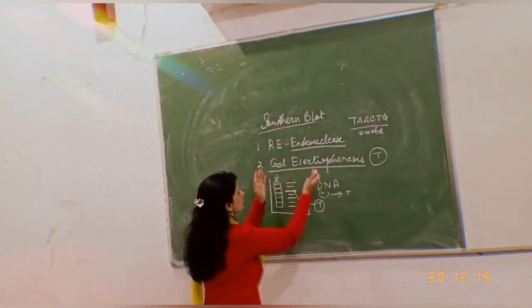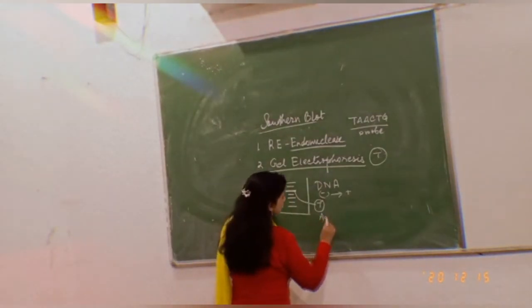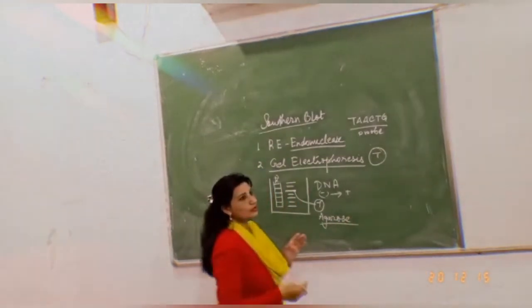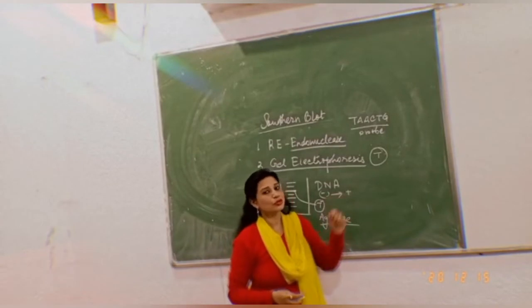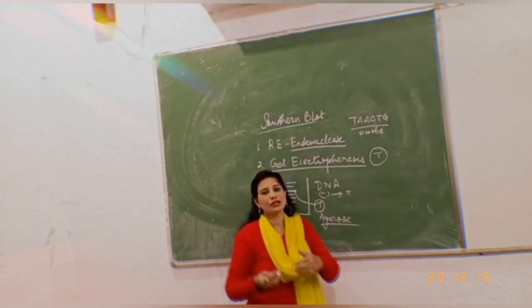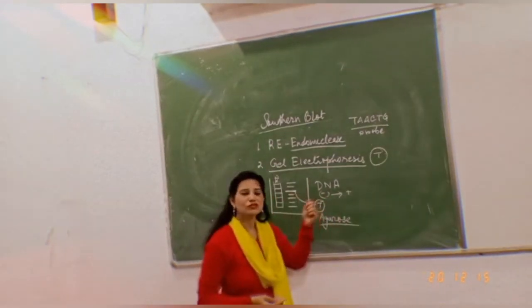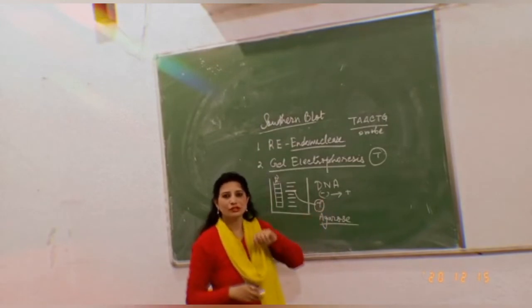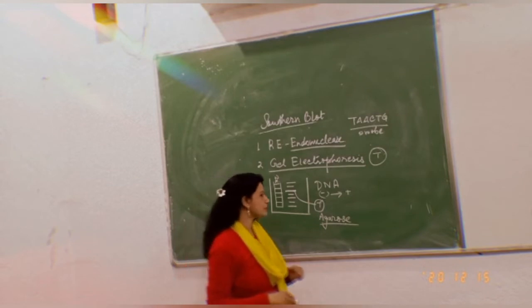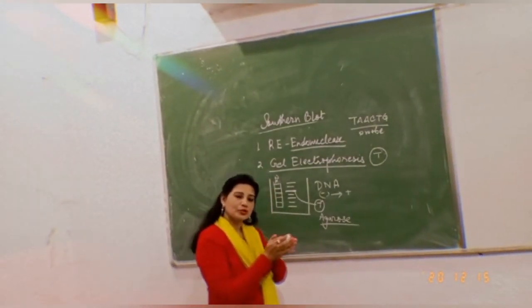So what I will do is open up the chamber and take out the agarose gel. The gel that is used in gel electrophoresis is agarose gel. Again, I will be dyeing it. For dyeing purposes, I can use some dye, but that dye will only help me to track a particular DNA molecule, a particular strand. It will not help me to achieve the band. So I will do that with ethidium bromide. Watch my video on gel electrophoresis, you will be able to understand. Ethidium bromide will be binding with the DNA and will give the band.